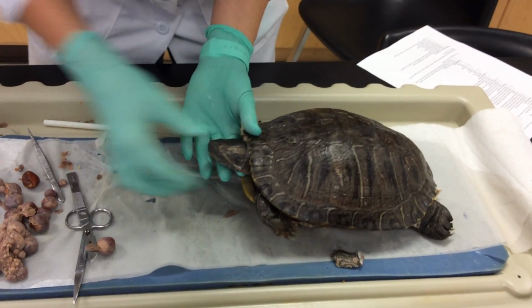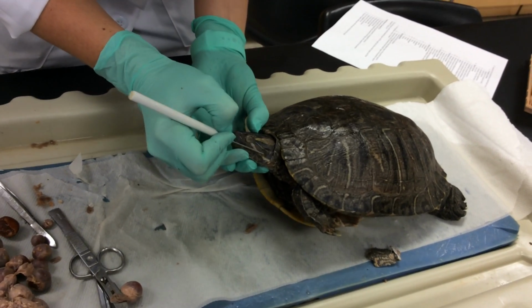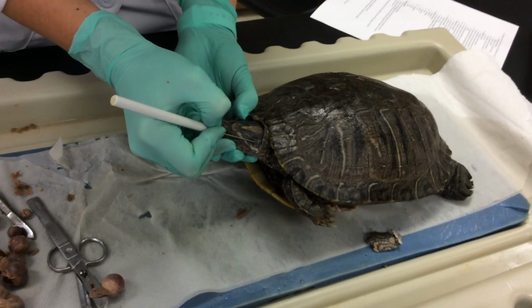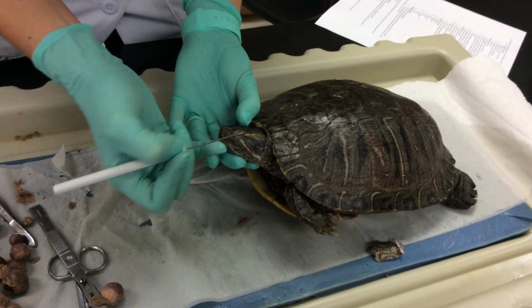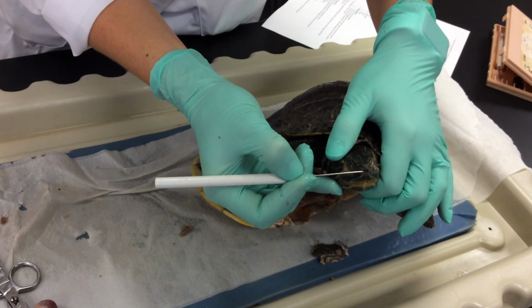A couple things we're going to note up here on the anterior head region is going to be the eye. Directly behind the eye, there's this round region. This is called the tympanum. The tympanum allows for them to pick up vibrations and for hearing. They also have the external nares.